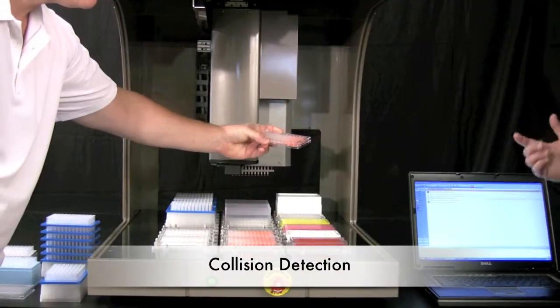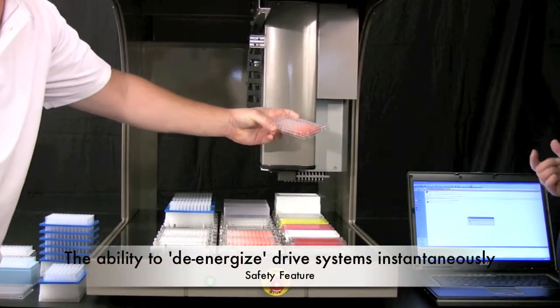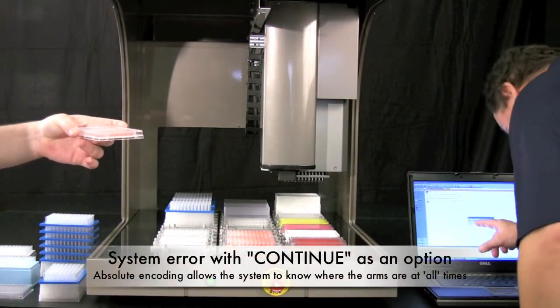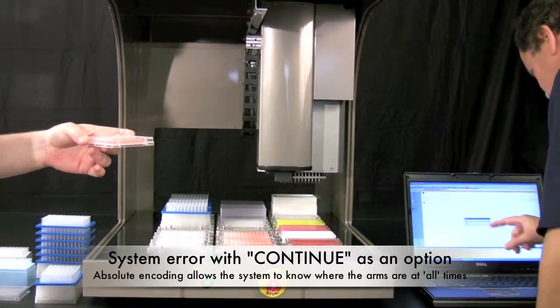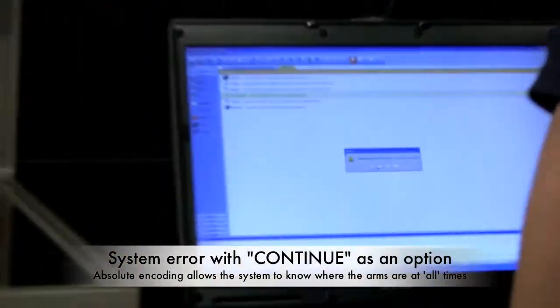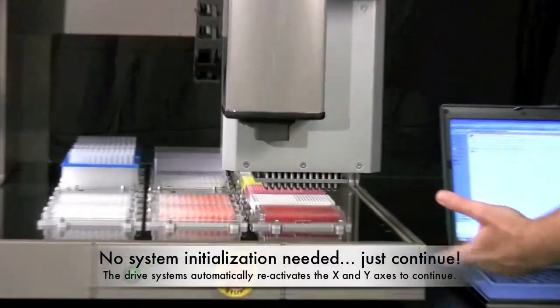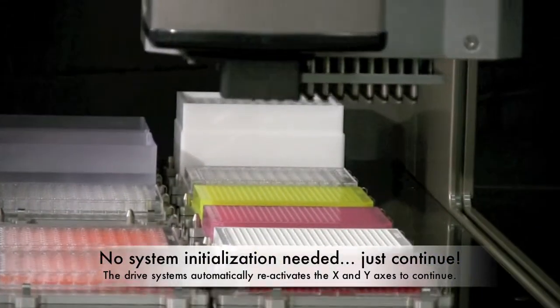In this clip, I've purposely interfered with the pipetting head. As you can see, the head realizes the collision instantaneously and de-energizes the motor, allowing the arm to float free. The system does recognize the error. However, all that's needed is to correct the collision problem and hit continue in the software — no complete system reinitialization is needed.